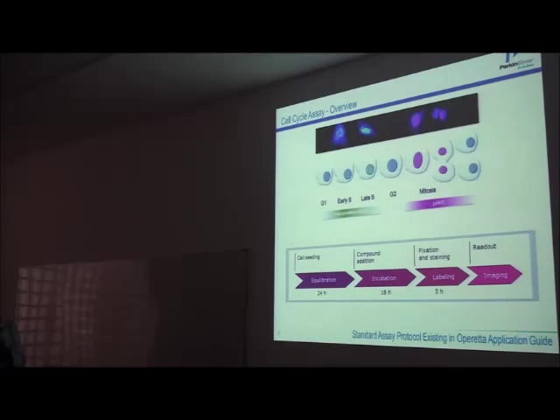For cell cycle, usually depending on how people have done the staining from the beginning, you can do it with a special staining for each of the phases. It makes it much easier. And otherwise, if you don't have it, just using single staining, for instance, you can also do some cell cycle analysis, which would look like what you did in flow cytometry. It's a little bit different. Right. So G1, S, G2, and mitosis. So that's what we did at this point.